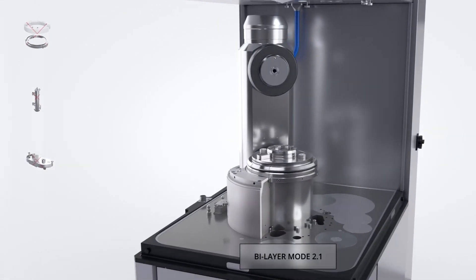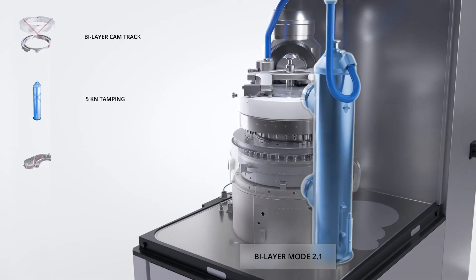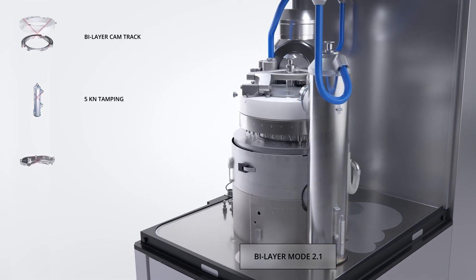Bilayer mode 2.1 is ideal for special applications where both layers have marginal flow properties and pre-compression on the final tablet is not required.